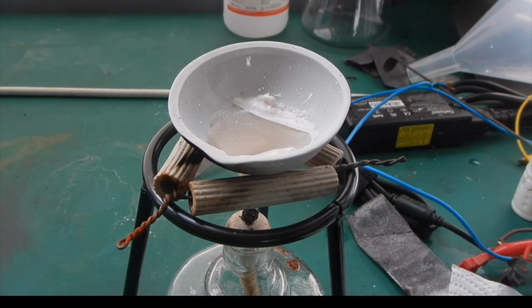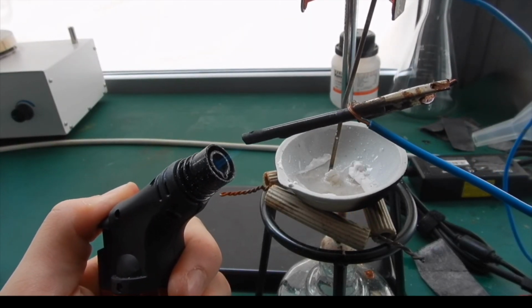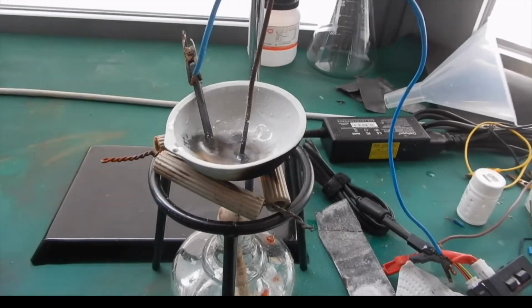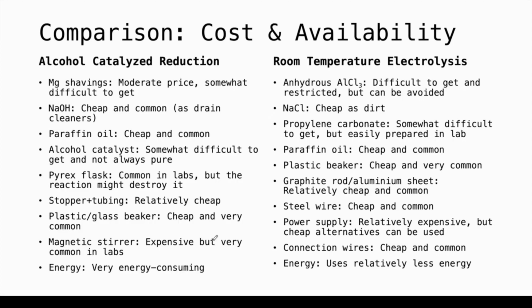5 months ago, I posted a video about making lithium metal by the electrolysis of molten lithium chloride and potassium chloride. While it worked, the yields were extremely low. More recently, I uploaded a theoretical video where I reviewed the main methods of making sodium metal and came to the conclusion that the propylene carbonate electrolysis route seems the most viable.